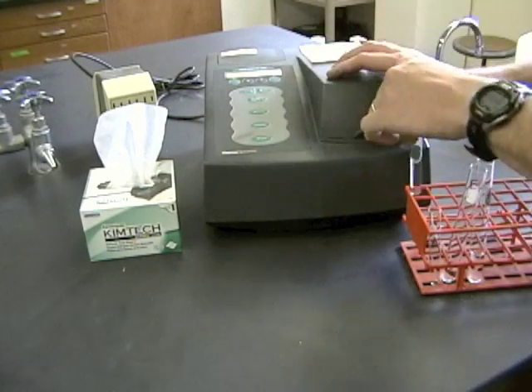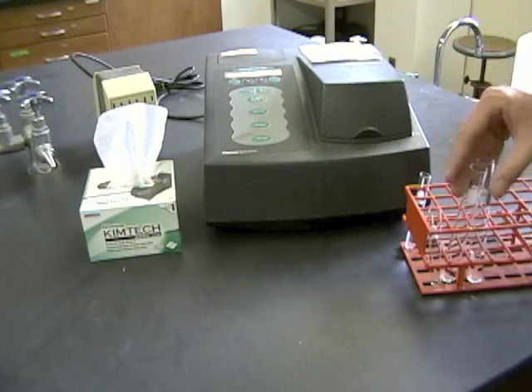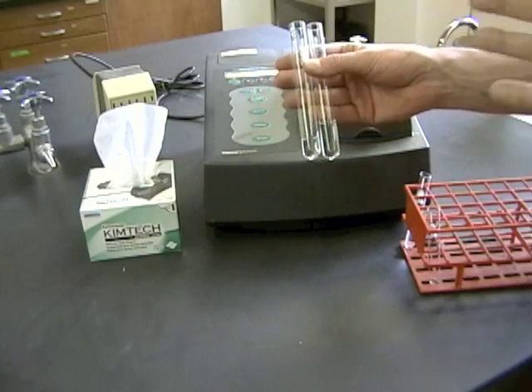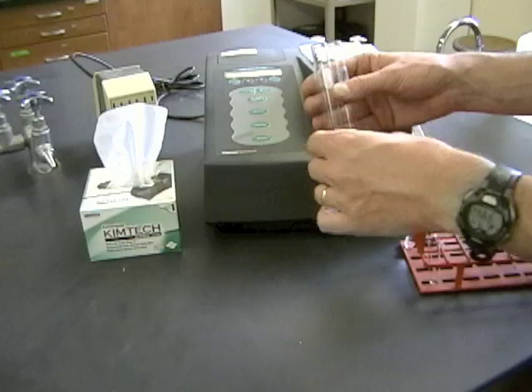I've already blanked it, so I'm going to take my blank out and save it for later. Now I've got my carefully measured reagents that have been incubated at the right temperature or the correct pH, and we're ready to go.